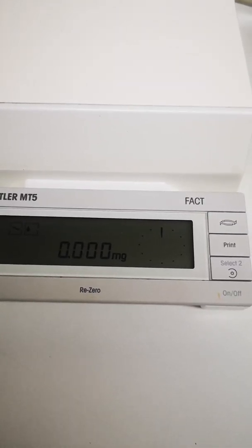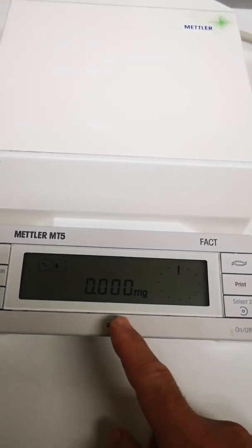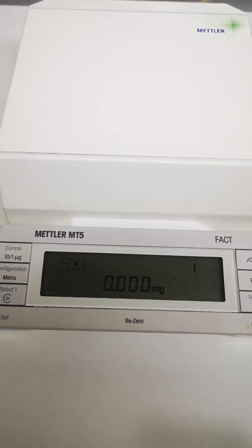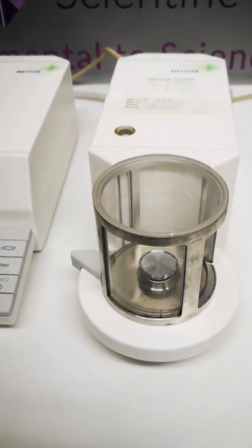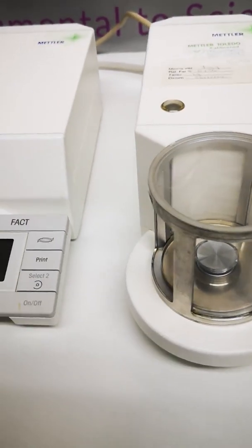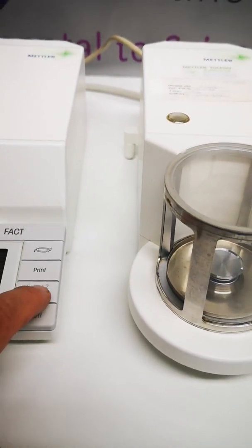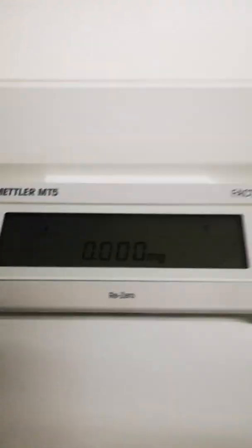There we are — re-zero complete. What I'm now going to do is move it. So the sample compartment is open there, we can put a sample in, and then I'll close it — and the sample compartment closes there.